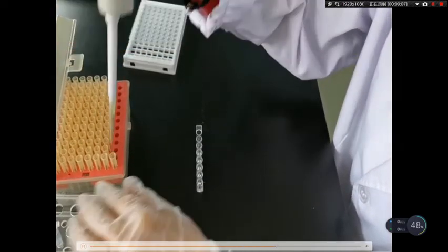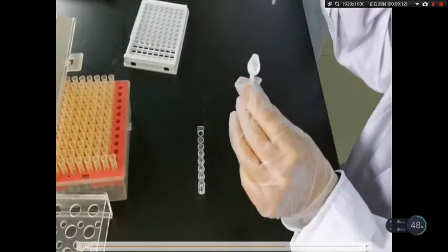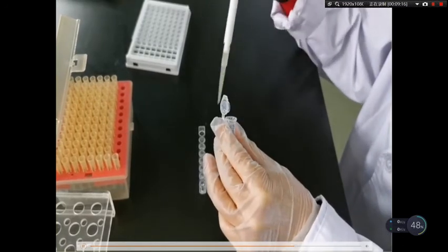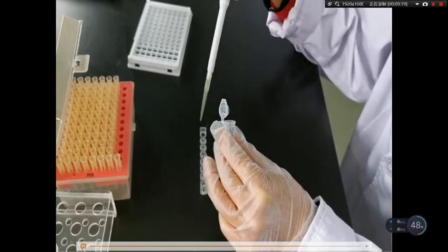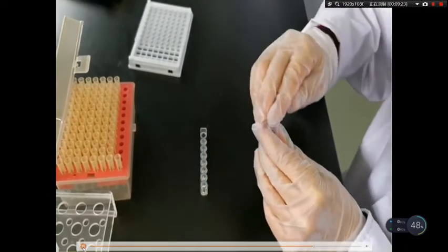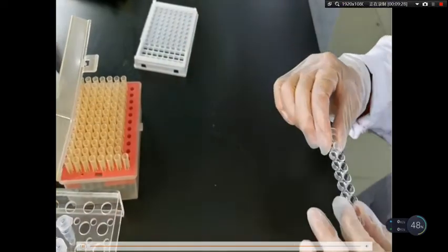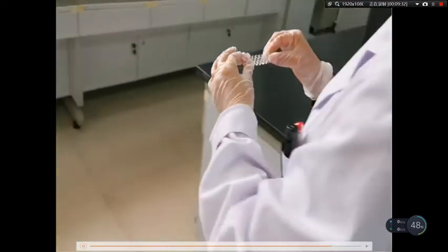The last 2 vials with the sample for detecting. Then we put it in a humidified box at 37 degrees Celsius.